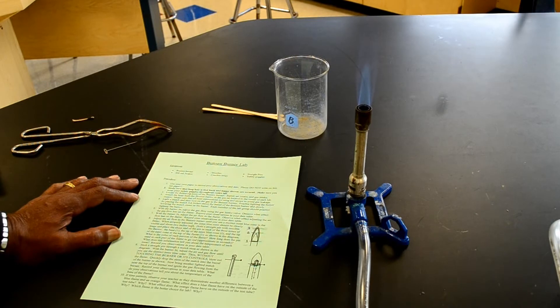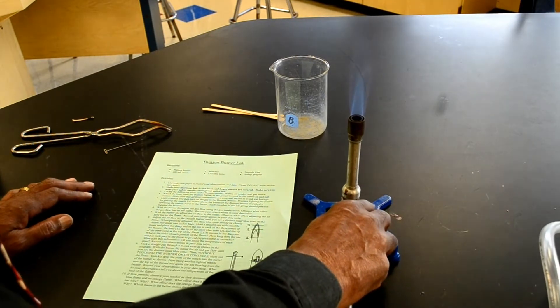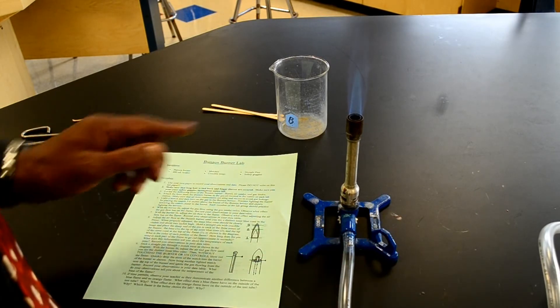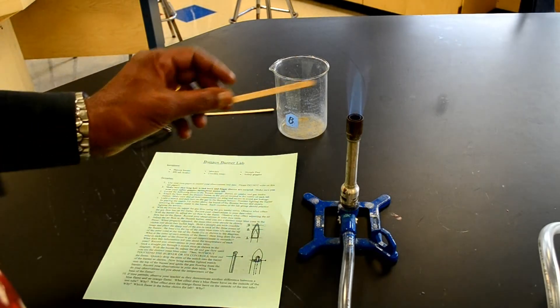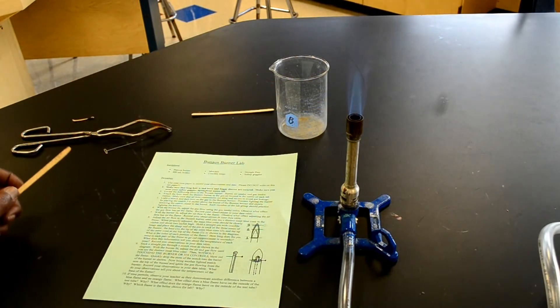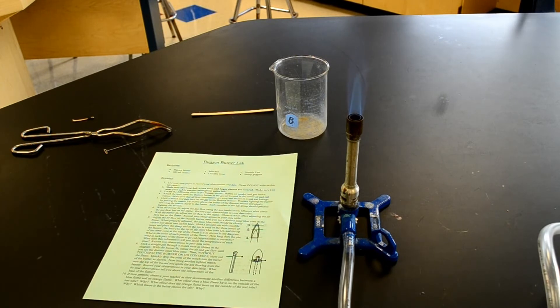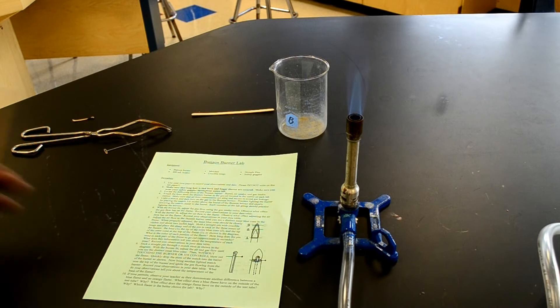Then it says, adjust the air flow to the Bunsen burner until you see a distinct blue cone in the flame. We have a distinct blue cone there, so we're already good with that part. This is the blue cone right here, it's the internal cone. When properly adjusted, the inner blue cone should be clearly visible and about two inches high. I think that's about two inches high, so this flame is good.